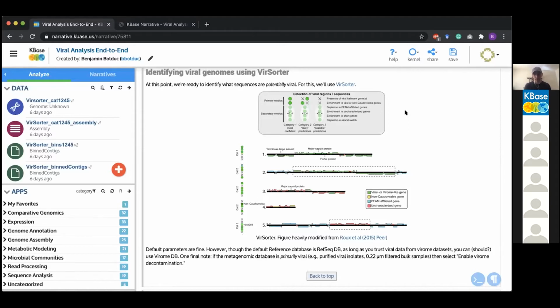And so these 3 categories are applied to both prophage identified by VirSorter, as well as non-prophage, like free viruses. And those are categories 1, 2, 3, as I've said, and 4, 5, and 6. 4, 5, and 6 correspond to the prophage that are predicted.